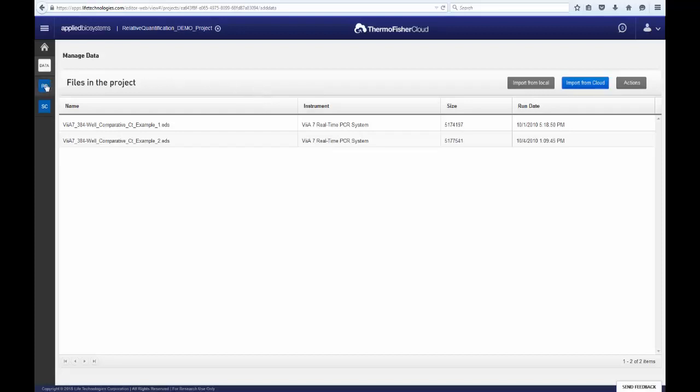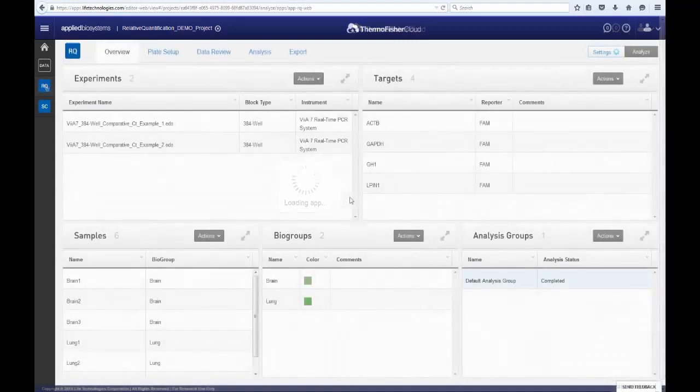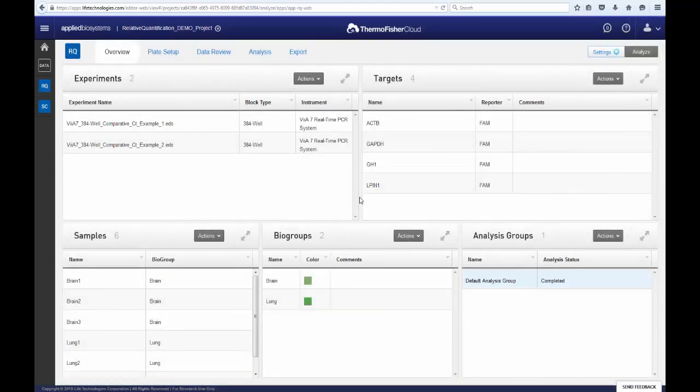Clicking on the RQ button on the side will open the app. This is the experimental overview page for the Relative Quantification App Module. Here is where you can at a glance view all the input data and their associated parameters for use in further analysis.